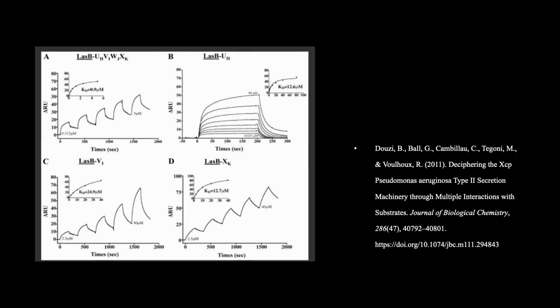And then the sensorgram is displaying a change in the response units over time, showing that there's binding and dissociation kinetics of the LasB with the components.